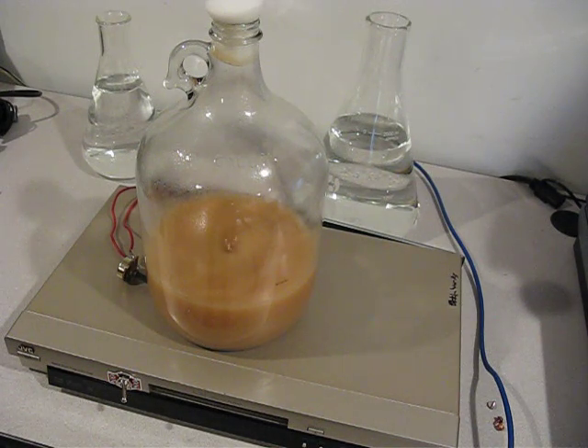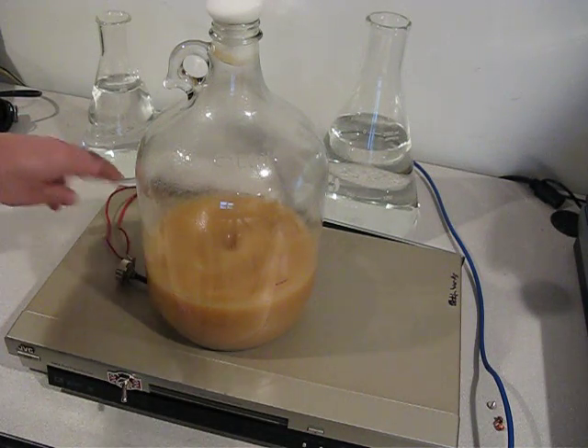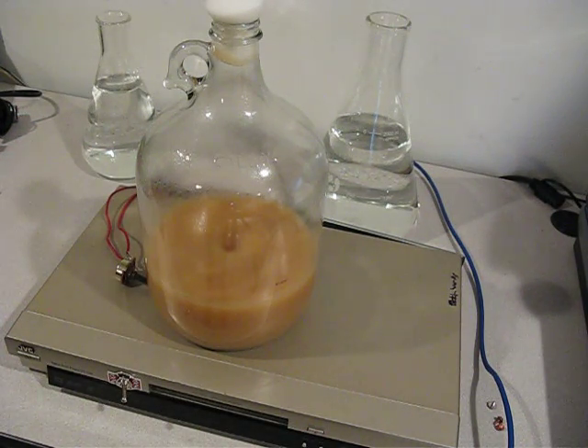If you watched my other video, you saw that I didn't include a potentiometer in that one — I've added one now. I thought I needed it to get started, but I really believe the issue was using Velcro to attach the earth magnet to the fan. I thought I needed to adjust the speed, but it wasn't the fan speed causing the magnet to fly off — it was the magnet warbling. Nonetheless, I've got the potentiometer added and I'll probably leave it. That's the update on the do-it-yourself yeast stirrer.